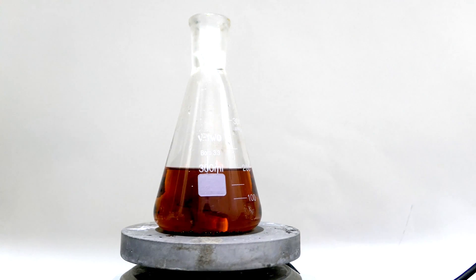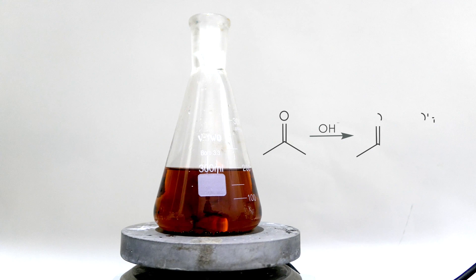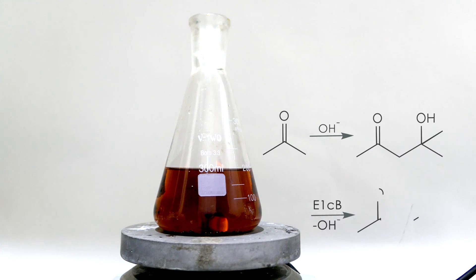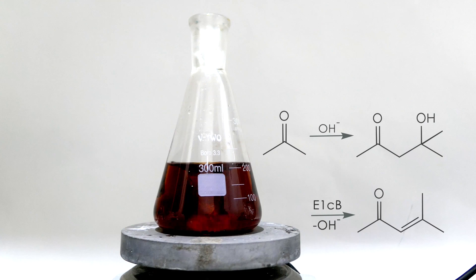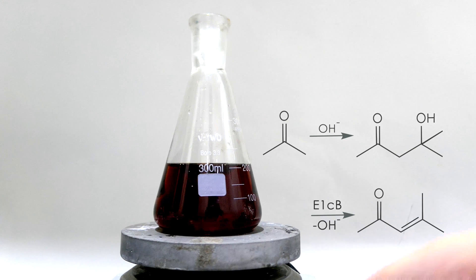So what's happening in the reaction flask? This is the second step of aldol condensation. Usually, beta-hydroxycarbonyl compounds lose water to form an alkene under basic conditions, like potassium hydroxide. But wait a minute, now it's a neutral condition. Why can this compound still dehydrate easily? The key is the elemental iodine.